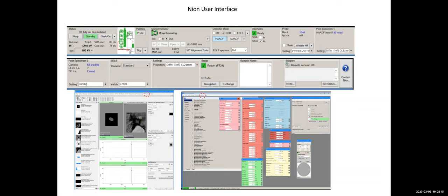And you're done with it. How do you change to number 2? Suppose number 2, DD31, is your sample. You just move your mouse over this number 2 and left click, and then something will happen. This part will show the procedures it will take to finish this sample exchange. Actually, there are many steps involved, but it's simple. You just click 2, and then it will take about 7 minutes to finish this procedure.